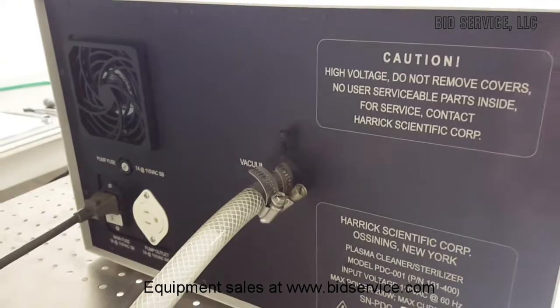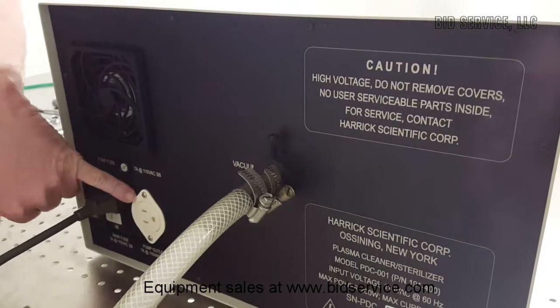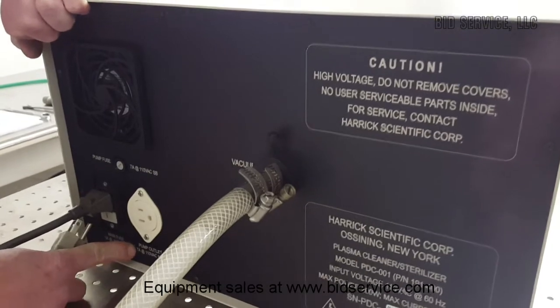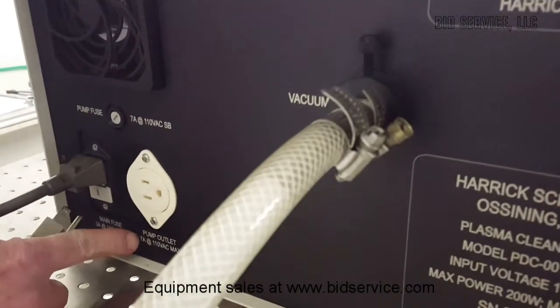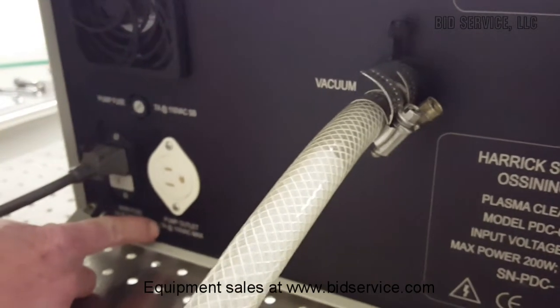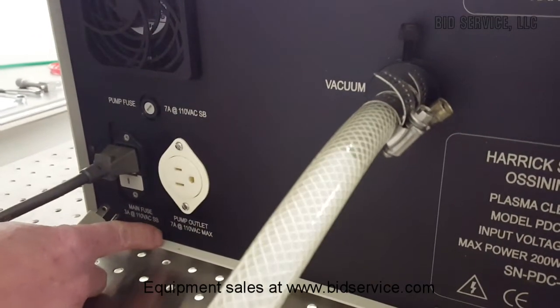Your vacuum pump can be powered by the unit itself from this receptacle right here. Be aware that it has a 7 amp rating, which is more than enough to accommodate most pumps that you would need for your process.